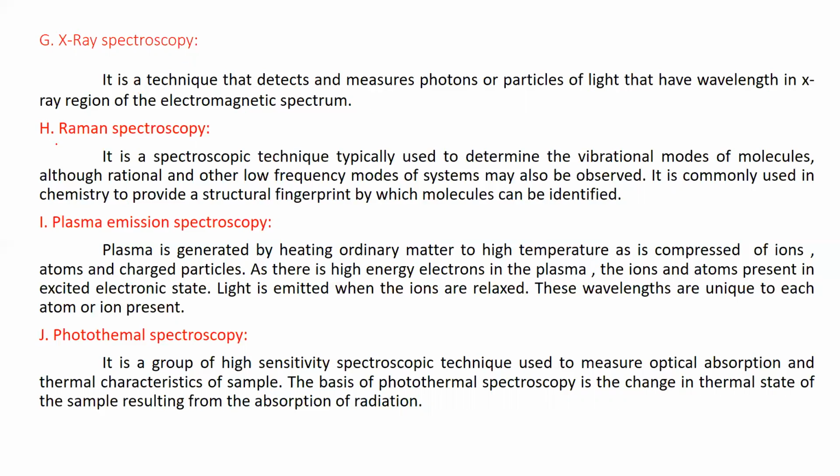And next one is Raman spectroscopy. It is a spectroscopic technique typically used to determine the vibrational modes of molecules. Although rotational and other low frequency modes of systems may also be observed, it is commonly used in chemistry to provide a structural fingerprint by which molecules can be identified.